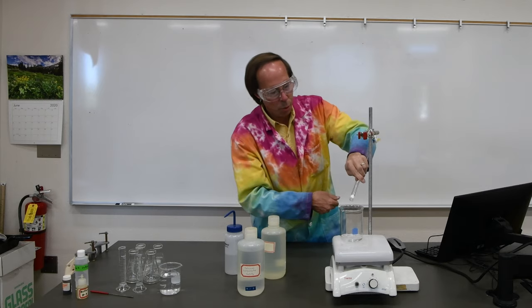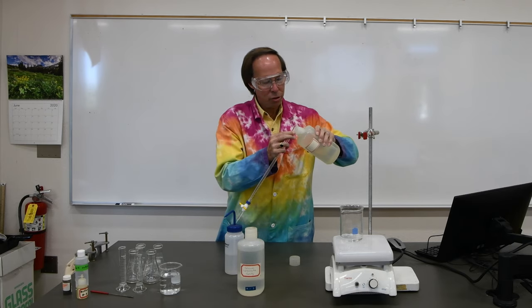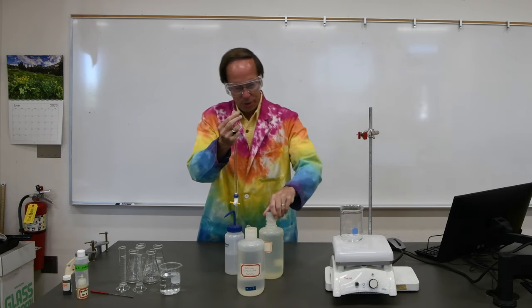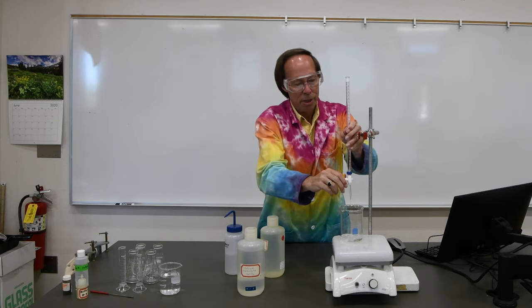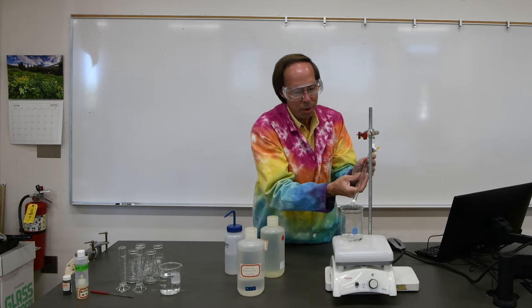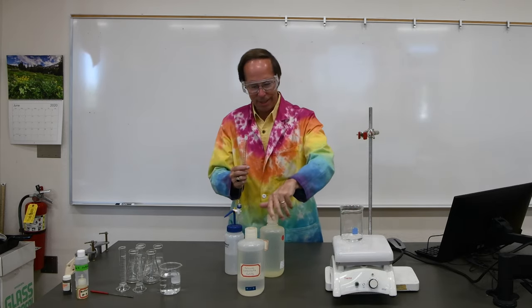And we'll go ahead, we can pour the rest of that out, and let's do another rinse just to be sure. We want to make sure there's nothing in here except the EDTA. There we go. So we'll shoot a little through the bottom, clean that out, and then we'll sort of rotate it as we drain it out the top. That should rinse out everything that's inside. So now there should be nothing in our burette except EDTA.